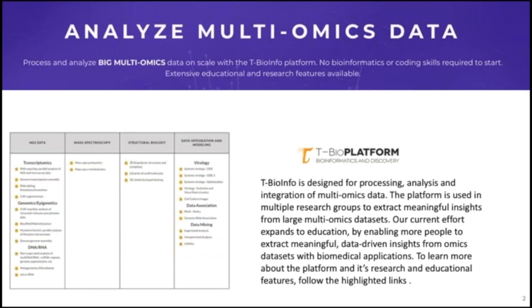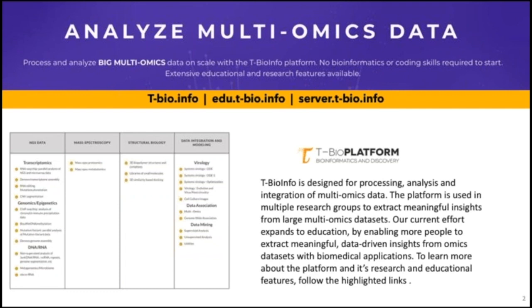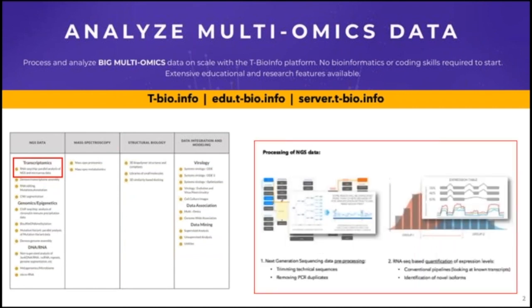As you can see, these are the areas of analysis that show different types of data that could be processed, integrated, and analyzed on the platform. Today, we'll be covering this section called transcriptomics. There on top, you can see RNA-seq. You can probably also see this on your screen. This section allows processing and basic analysis, things like differential gene expression.